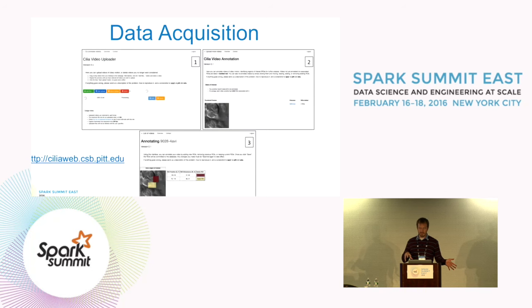As kind of an aside, we have this lovely website that we've been using to acquire data from our internal and external collaborators. Very easy to just upload a video. It even lets you draw regions of interest if you are so inclined. But we also have an automated method of doing the same thing.